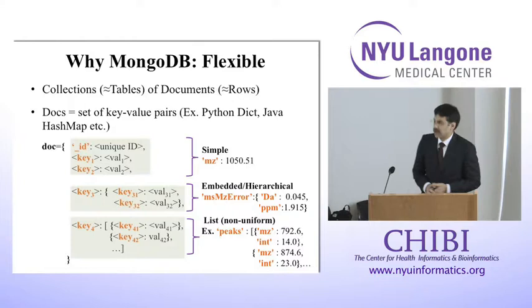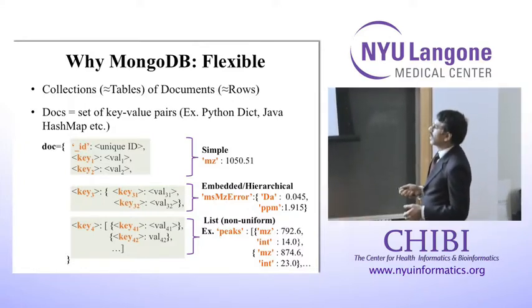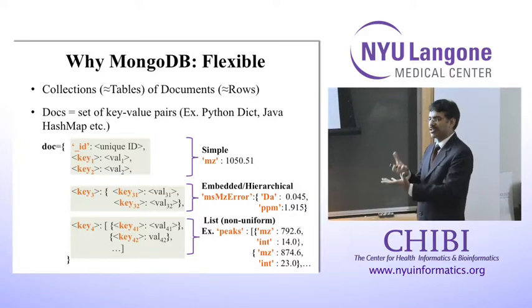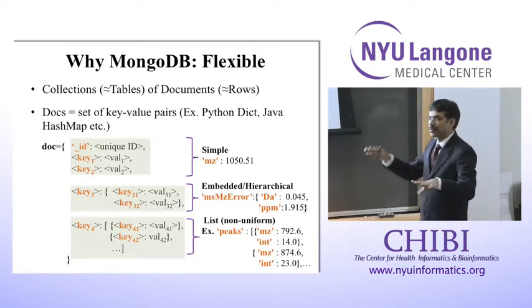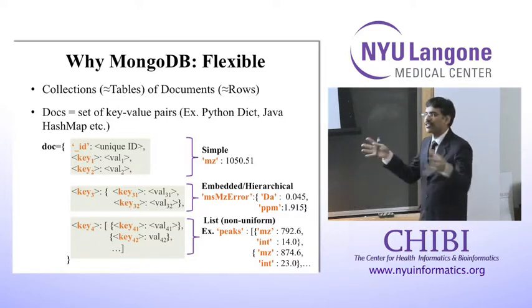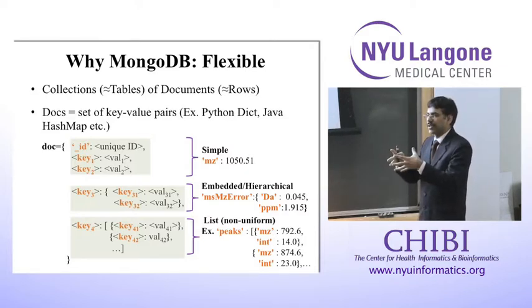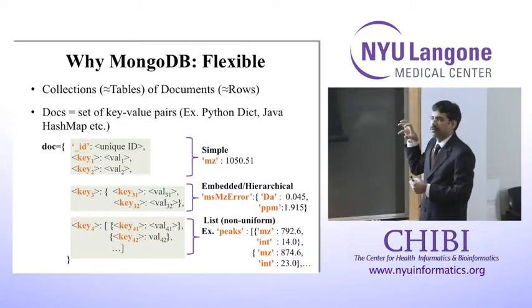This one? Okay. So aggregation is this entire document. Okay? In the previous example, I showed that you will have peptide information, you will have spectrum information, you will have the match information, which peaks matched, which did not match, and all those characteristics, right? So in relational databases, all those pieces of information will go in different tables, in different columns, and different rows, basically. Whereas here, everything is stored as a single document. You don't have to do a complex join across different tables. So it's sort of an aggregate unit. Okay? So you can just do one simple query and pull out the entire set of information at once.